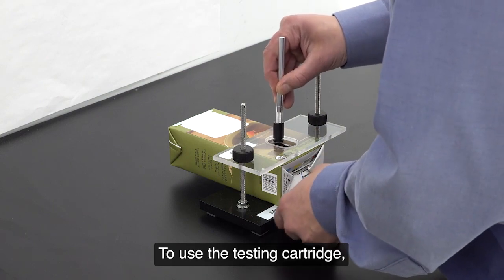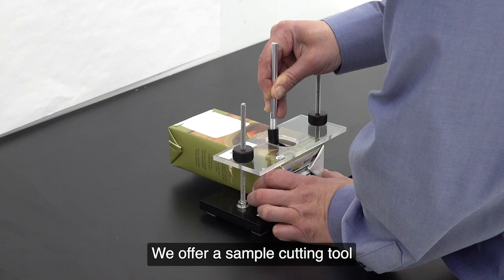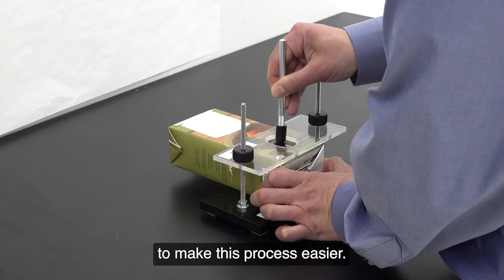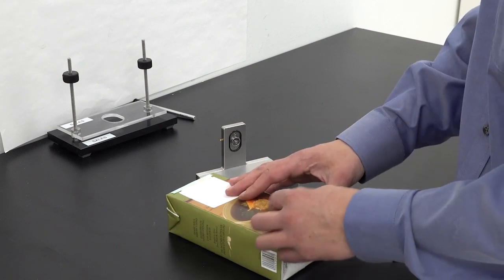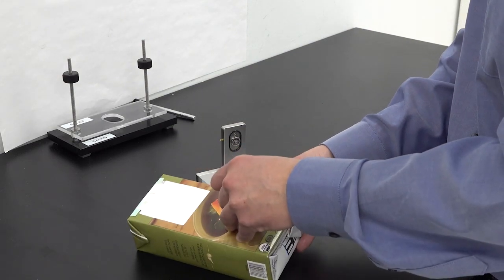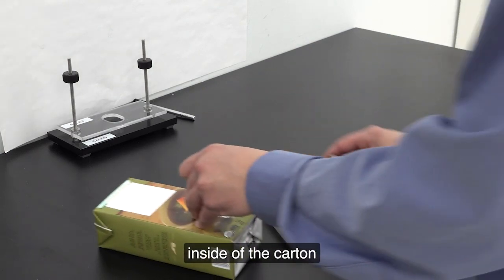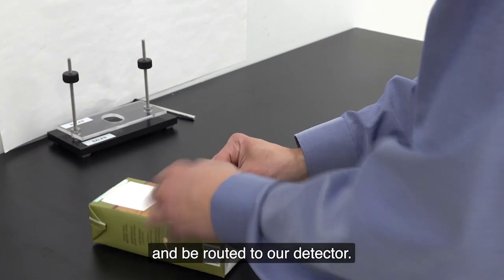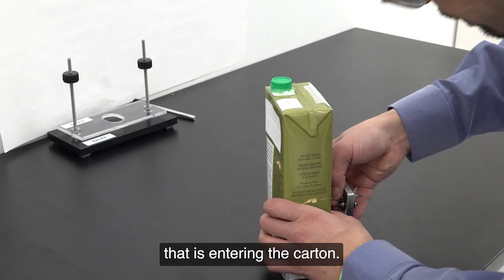To use a testing cartridge, you simply remove a section from the carton sidewall. We offer a sample cutting tool to make this process easier. An insert sits inside the cutout that is pulled through and sealed to the base of the cartridge. The insert causes the carrier gas to flow inside of the carton and be routed to our detector. You can then quantify the amount of oxygen or CO2 that is entering the carton.